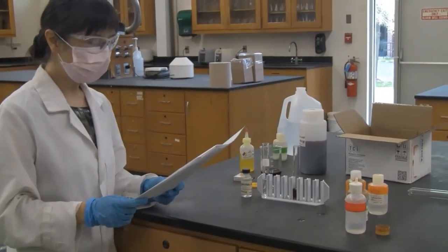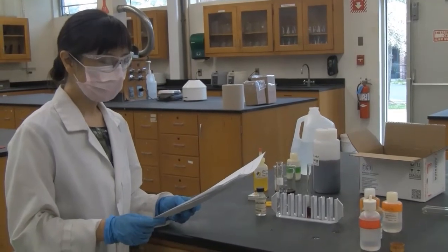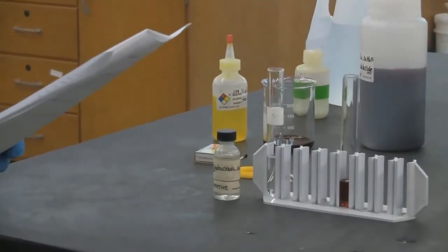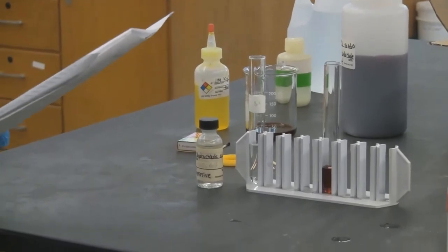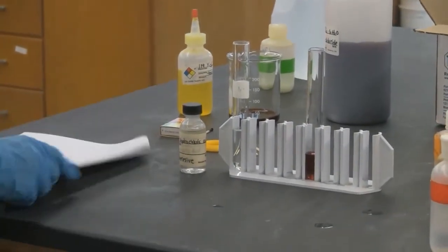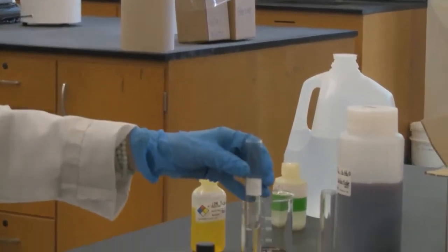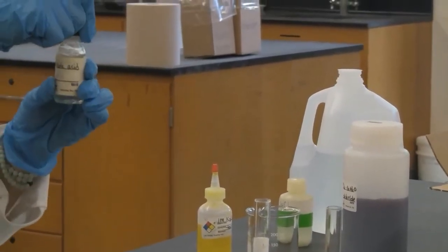Okay, this part is a saturated sodium chloride solution. It's saturated, it's already an equilibrium system. By what? The solid sodium chloride and the liquid sodium chloride are forming and dissolving at the same speed. So that's why from outside you don't see any change. It's saturated, it's equilibrium. Okay, but I want to break this by adding hydrochloric acid to it.